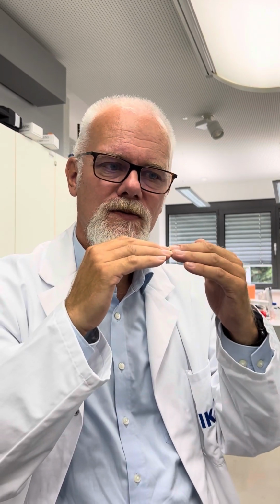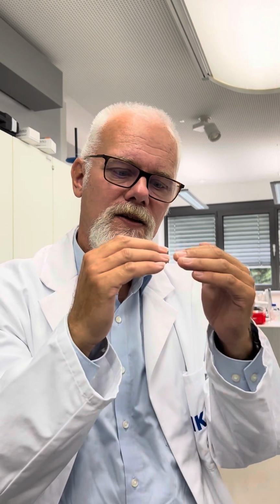And the problem is, normally this is very difficult. How can you know how much sample weight you need to get the same temperature increase? You cannot know, because the sample result is unknown. When it's some unknown sample, how do you know that it will be exactly that much to create a temperature increase of 3.4, 3.5 Kelvin? So theoretically you would have to make a pretest to see how many grams you need to get a temperature increase of 3.4 Kelvin. But that's not practical.